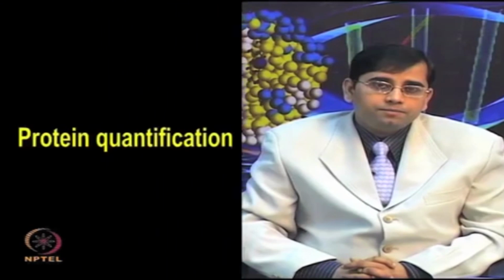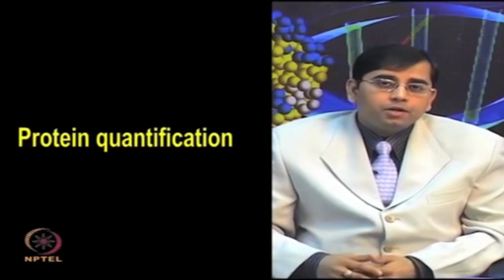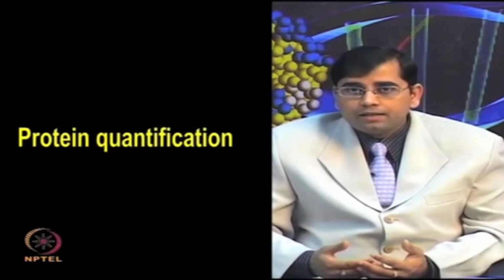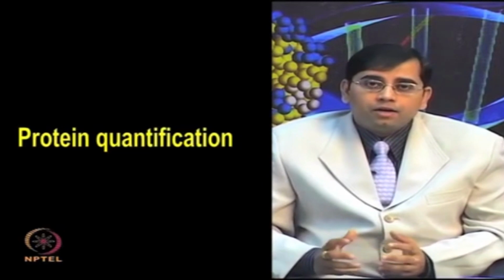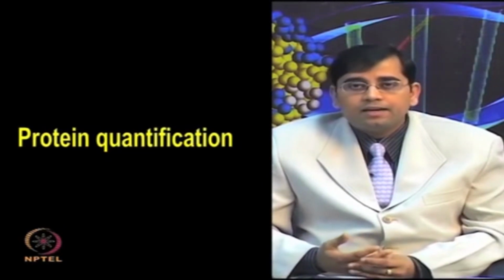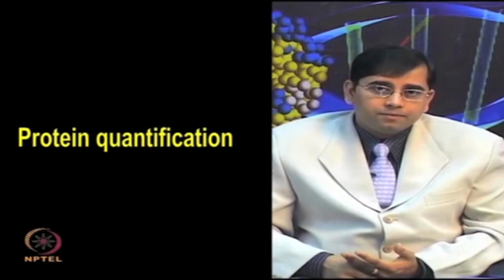So, now let us move on to the next topic, which is protein quantification. By now you have prepared your protein sample by using different types of methods, keeping a very careful eye on different types of interfering substances and contaminants, and you try to eliminate all of those components.